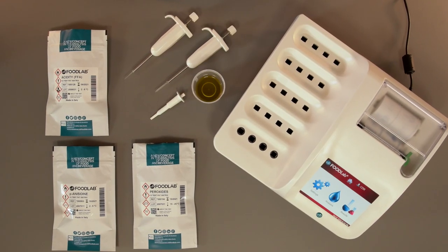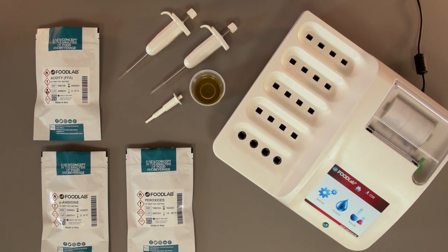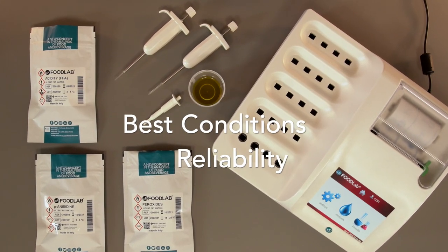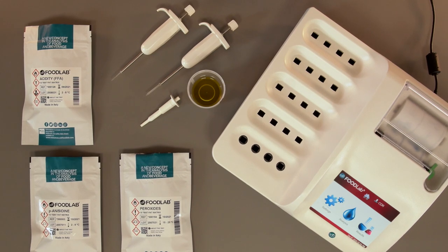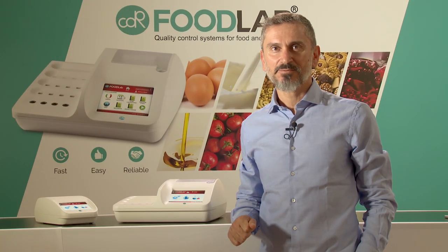CDR designs and manufactures analyzers and reagents. This is a key point because it ensures the best condition and reliability of the whole system. And now Giulia will show you how the CDR Food Lab works.